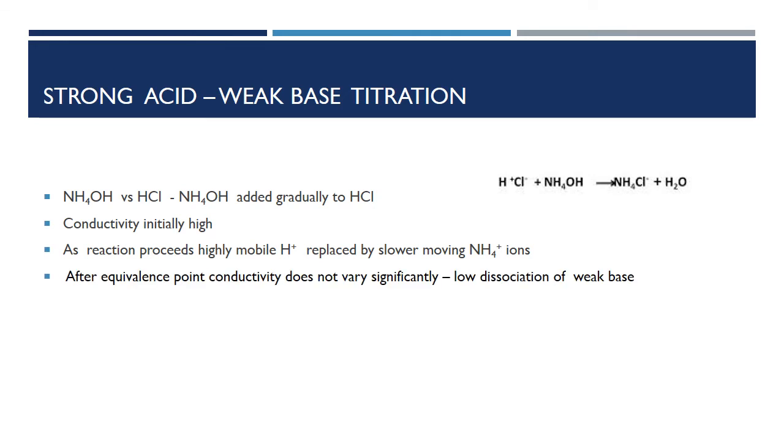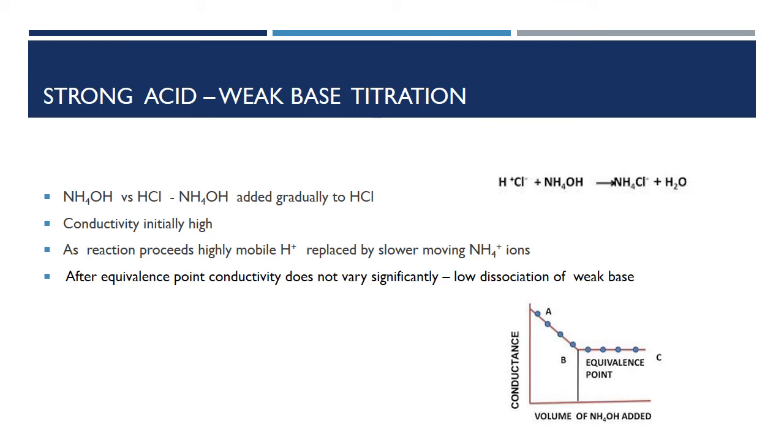Once the acid is completely neutralized, the conductivity does not vary significantly as ammonium hydroxide, being a weak base, is only weakly dissociated. The point of intersection of the two linear portions of the curve gives the endpoint.